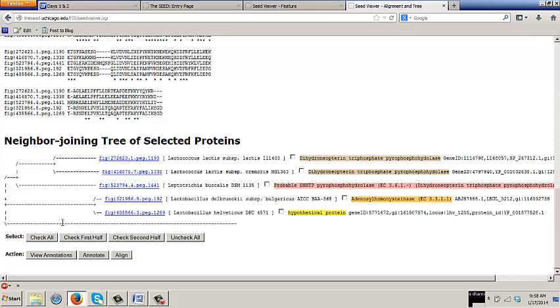You can use this tool, and you know that some genes are real and that you've annotated those carefully and you've got good evidence that that's what they are. You could legitimately re-annotate that one as being this, because it's grouped with it. You might not want to do that yet with these because these are not in the same clade.